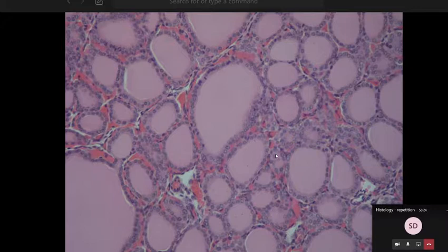Between the follicles, because this is the endocrine system, these red structures with flat nuclei are the blood vessels, these are the capillaries, sinusoidal or fenestrated, sorry, let's keep the version of Professor Duszewska, because hormones produced by the follicular or parafollicular cells should enter directly into the circulatory system, okay? And here in the middle we have a nice follicle.